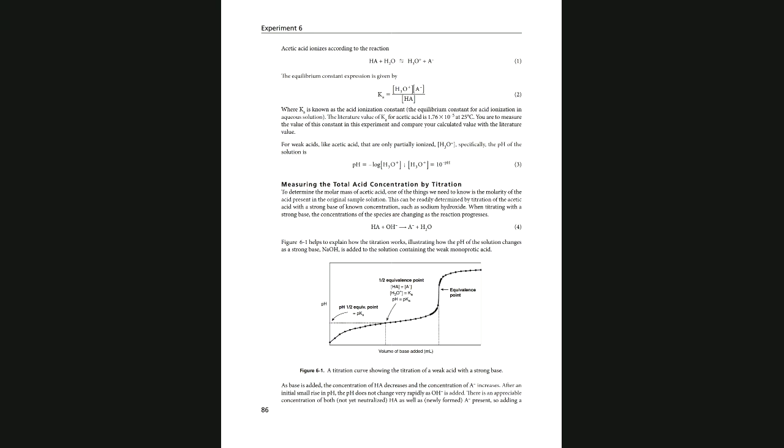So the purpose of the experiment: the methodology is the same, it's the titration. The device that you are using is the same, but the application is different. First of all, you are going to see the pH meter, the change in pH, and when you see those graphs in lecture, you understand what it means: you start with the acid, pH is low, keep adding base, the pH is going to increase, but you have a sharp point where it's changing from acidic solution to basic solution, and you have your equivalence point right there.